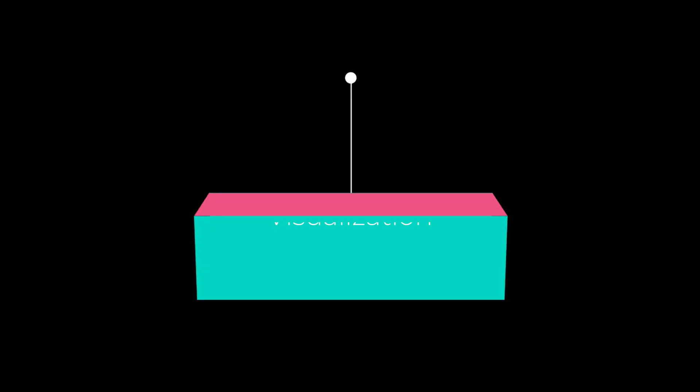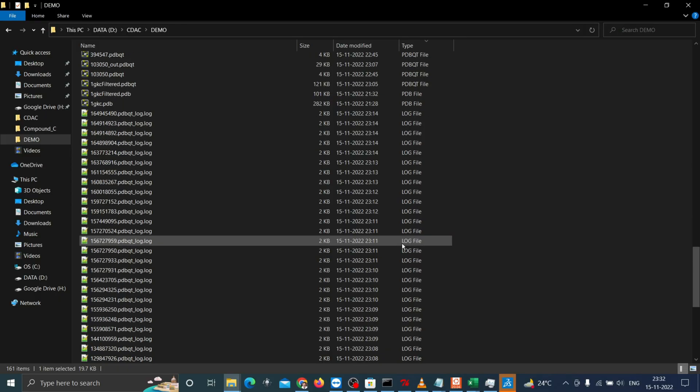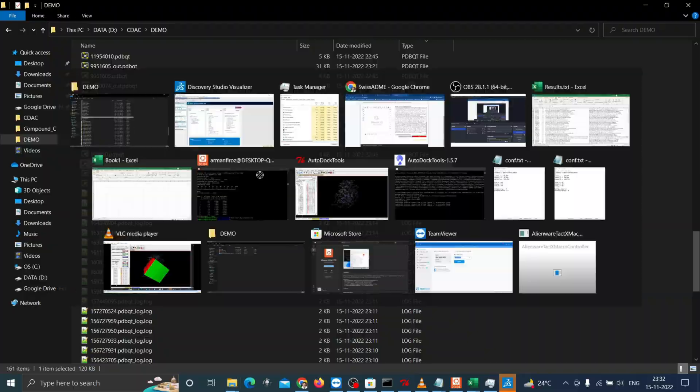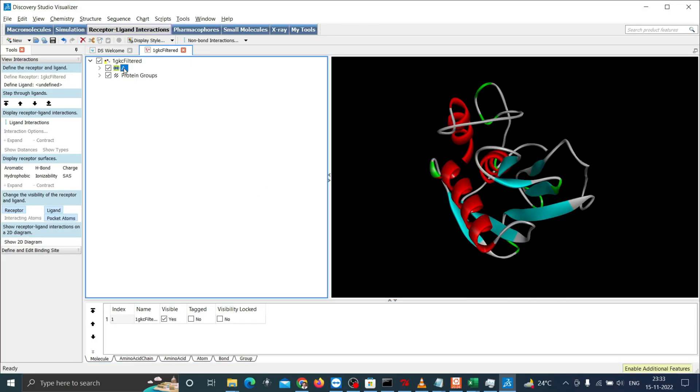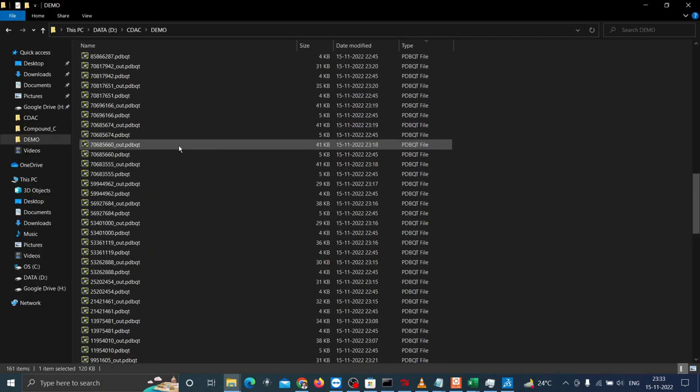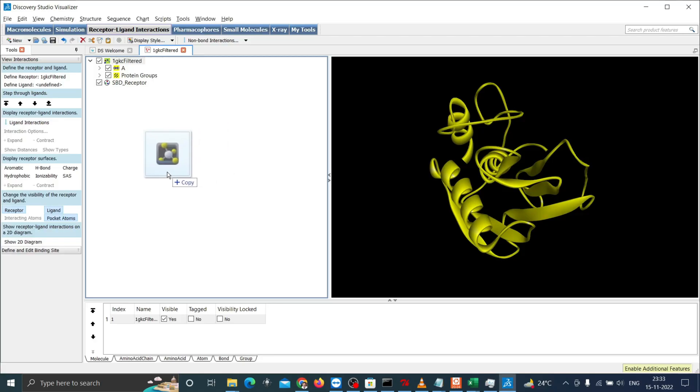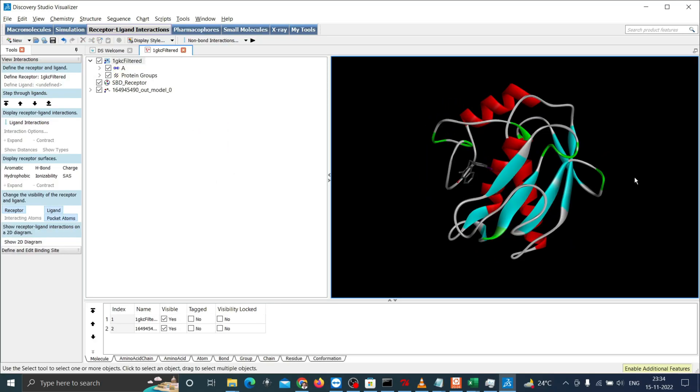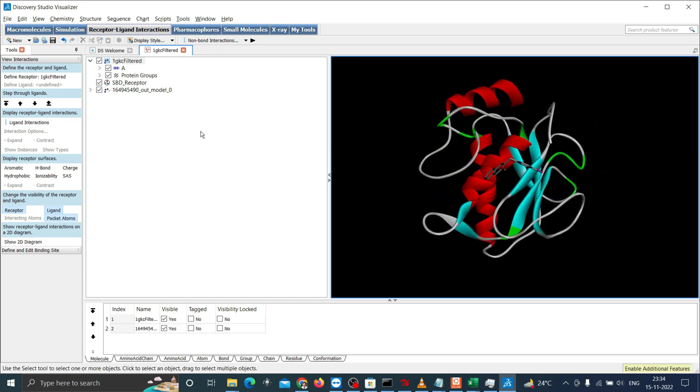Coming to the visualization tool, I use Discovery Studio which is freely available. Go to the main directory and open the receptor first and then define the receptor. Then drag the output which you want to explore. For example, I'm opening this output along with the receptor. Now you can see both in the same image.